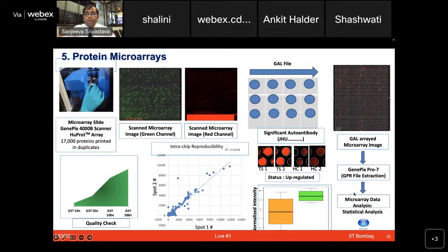So let's take you again to the lab, and Arko is going to show you our microarray instrument setup, which can be used for doing these kinds of experiments. While Arko shares his video, here we have the different types of arrays shown on this slide, looking at the human proteome arrays, which look for all the human proteins, and we are also currently looking at some of the SARS-CoV-2 viral proteome. So those kinds of chips.